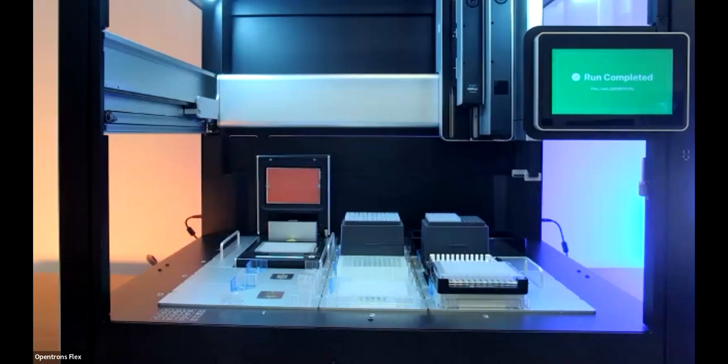Cool, I can grab this next one. So do we have any tip on or tip type verification? Yes, so one of the very exciting things about the new pipettes on the Flex is that they have a number of new sensors that will allow us to do all sorts of things. In this example, we have an optical sensor that will be able to determine if a tip was properly attached or ejected. So yes, we do have tip on, tip off verification.